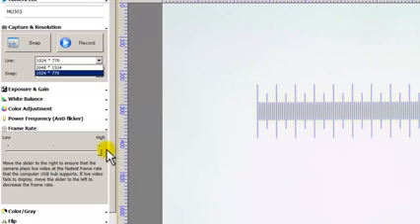Part of it could be because your camera can't handle the highest resolution. So I'm going to lower this frame rate level all the way to low, just simply by clicking it. And there you go, low. And I'm going to change this to the highest one for my camera, which will be 2048 by 1534.